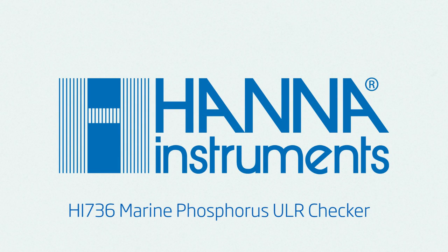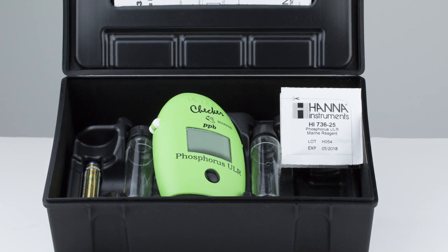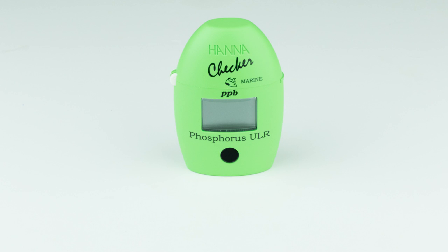The Hanna Instruments HI736 Marine Phosphorus Ultra Low Range Checker is a compact and portable meter that bridges the gap between simple chemical test kits and professional instrumentation. The one-button design allows users to operate the meter with ease. Today we will go over the proper use of the HI736.